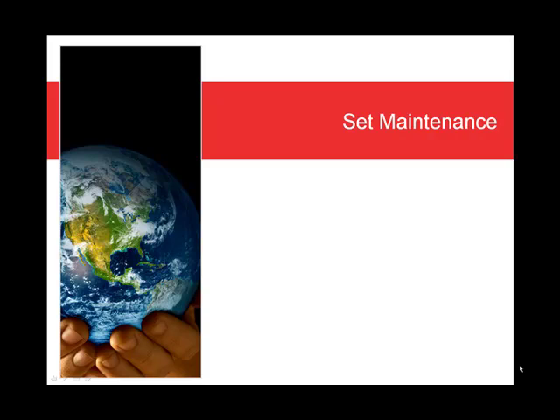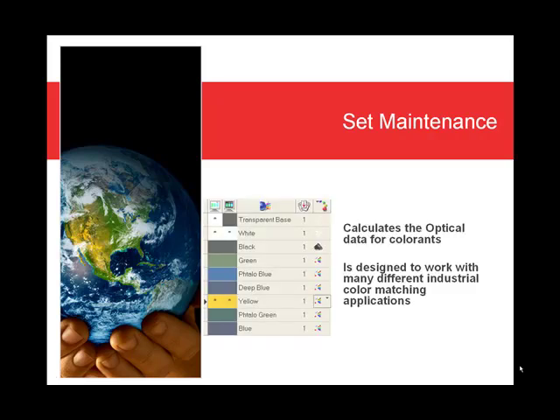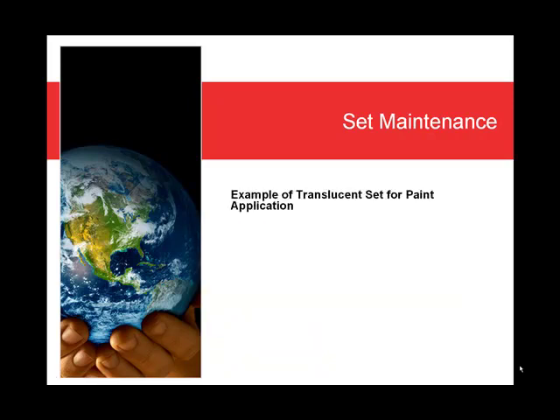Set maintenance is the program module that calculates the optical data of your colorants and is designed to work with many different industrial applications. In this video, we will show you an example of how to enter a new colorant set for a paint application.